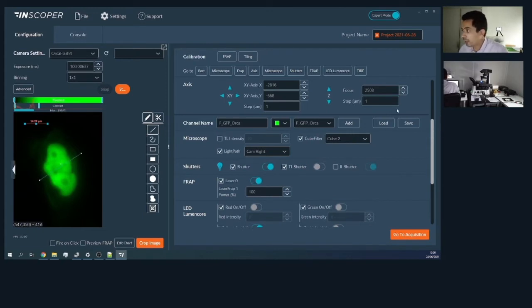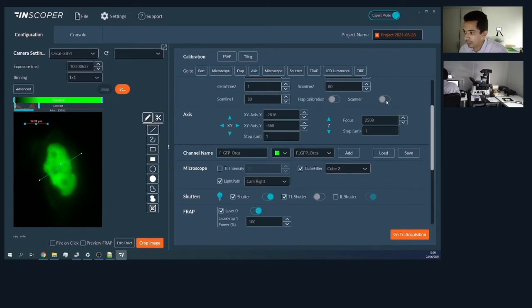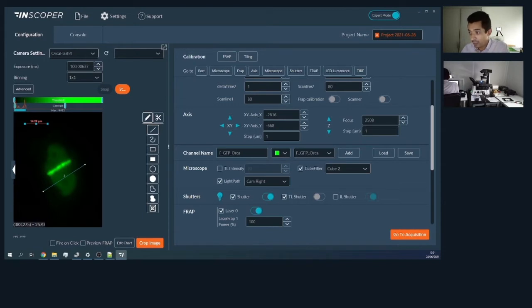So I will draw a line across the cell, and then I will send the laser within that line, and then as you can see the dynamic inside the cell, in fact. So here you can see that on the line I photo-bleach, there is a dynamic from the other zone of the cell to that line, and other parts of the cell lose their fluorescence.